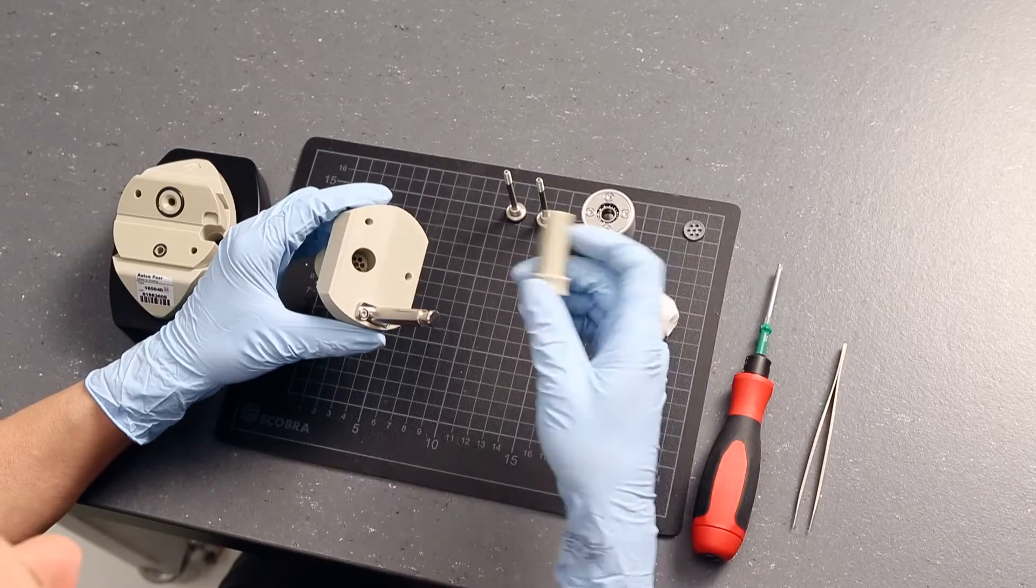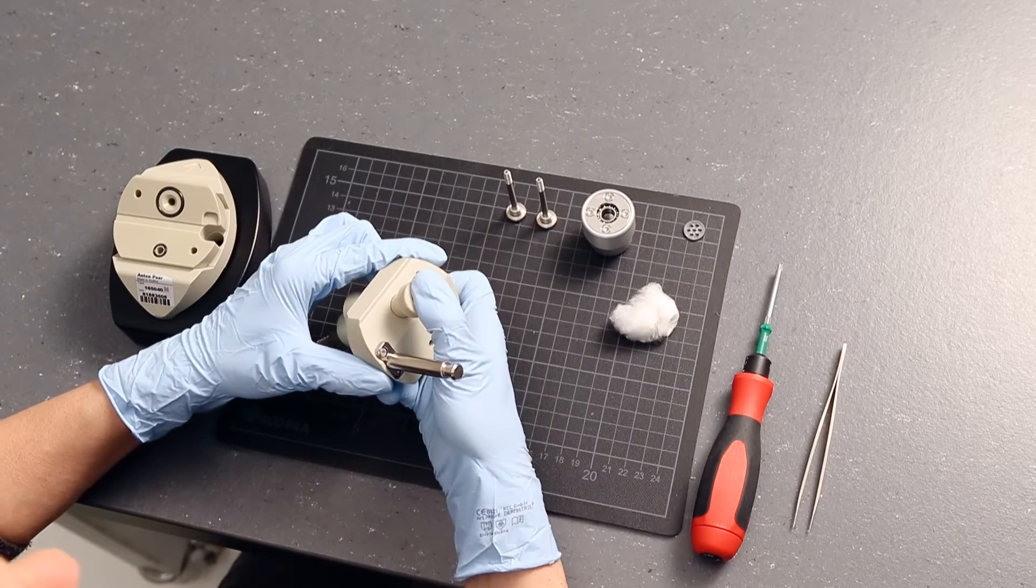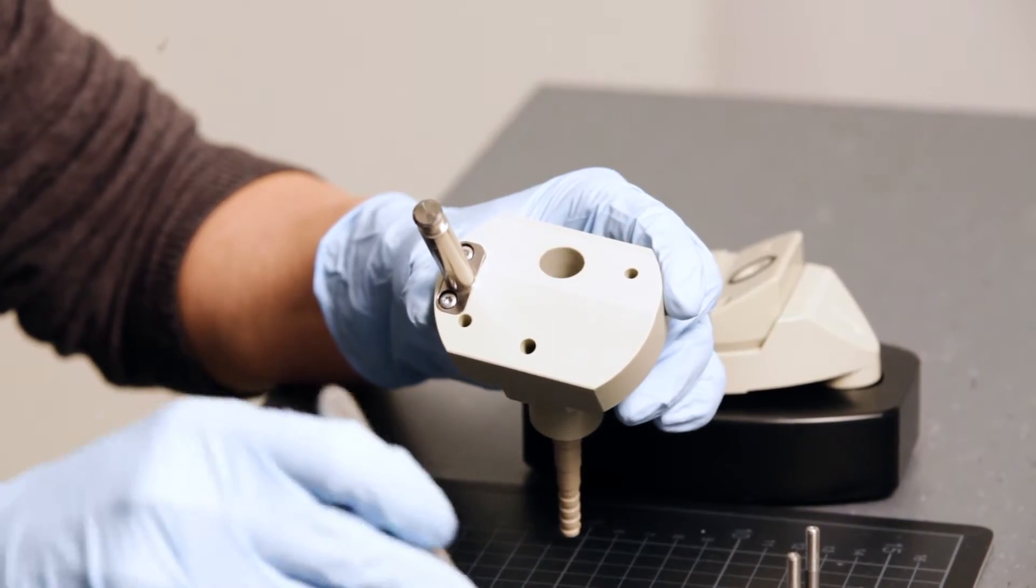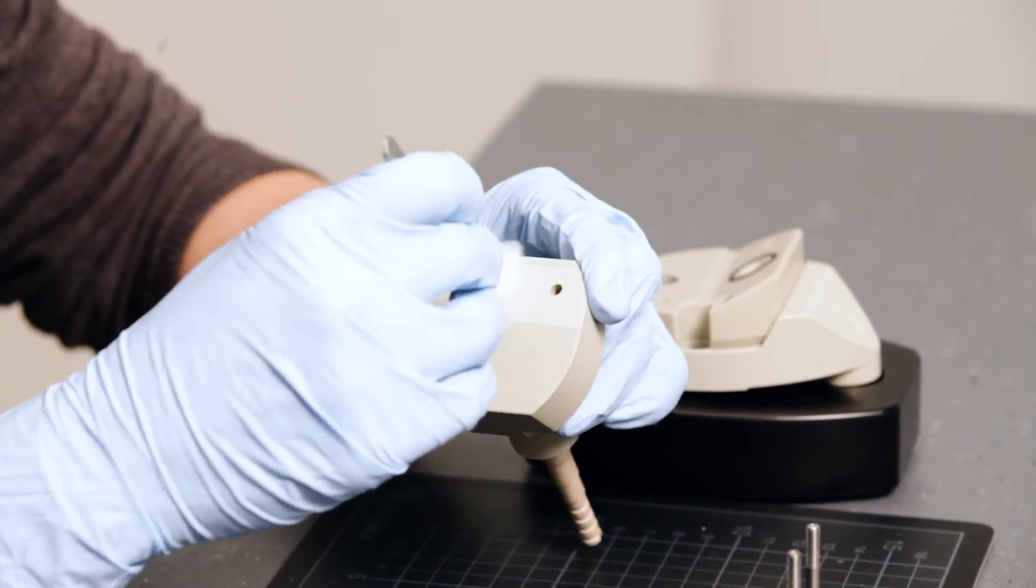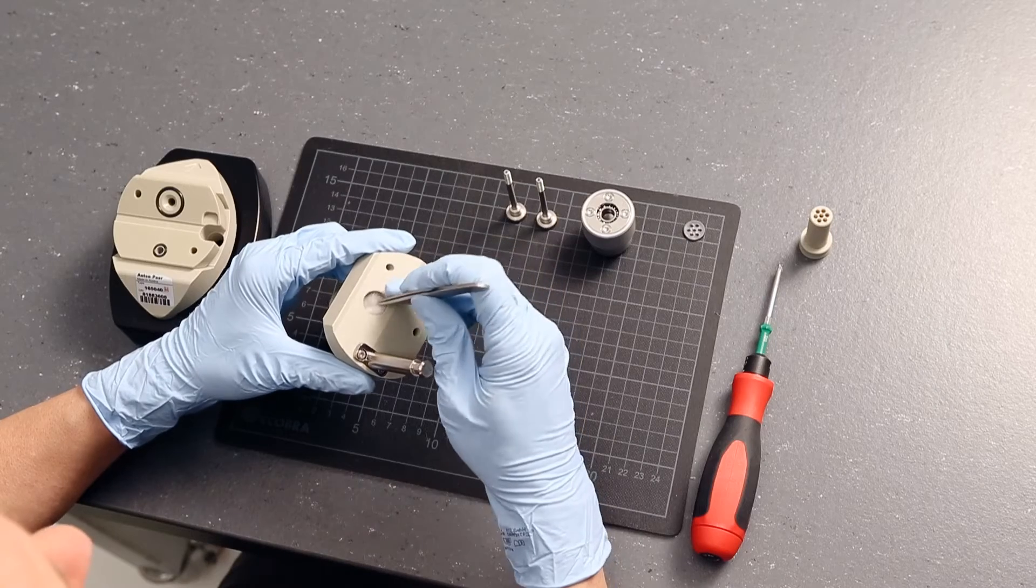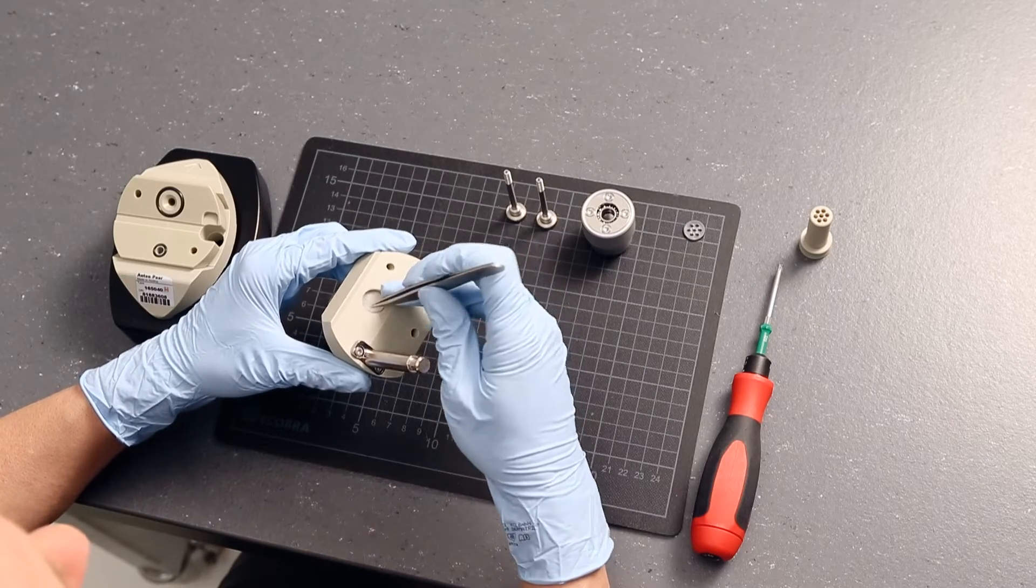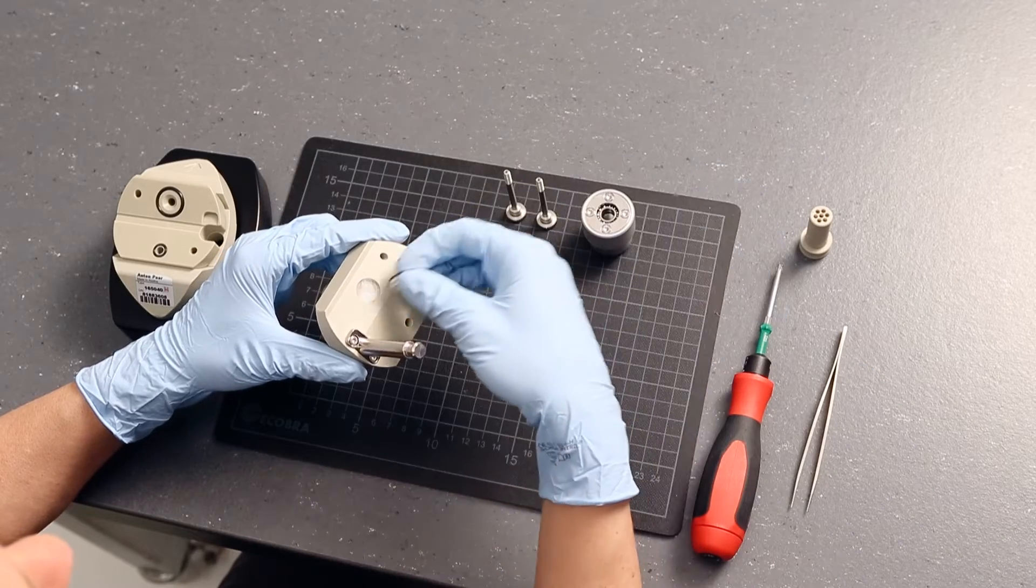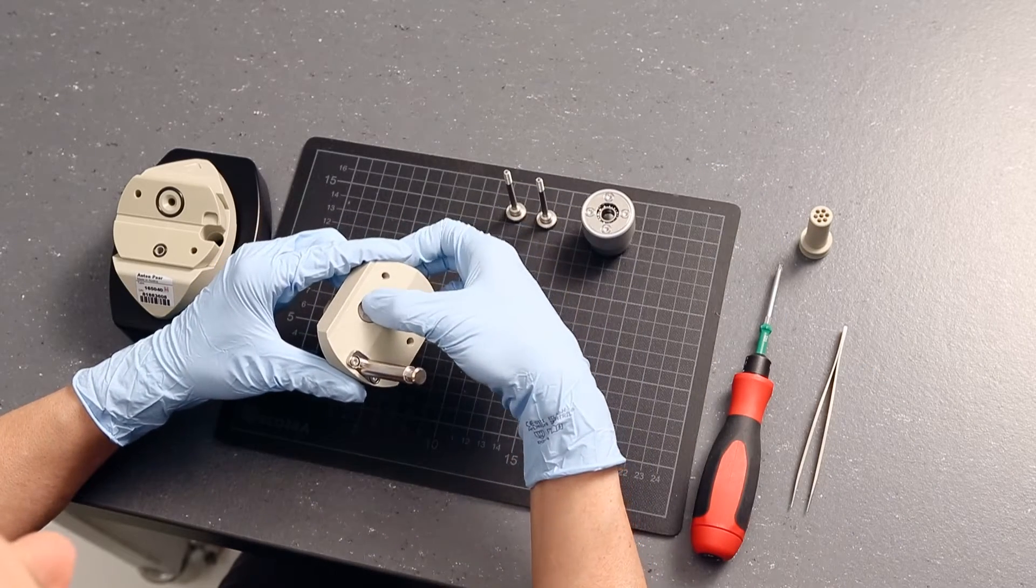Use the mounting rod to push the shaft to the bottom. Insert the fiber sample into the cylindrical cell. Fix the fiber sample in the cylindrical cell by using one of the support discs.